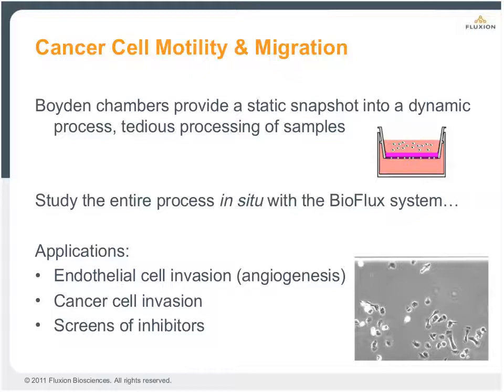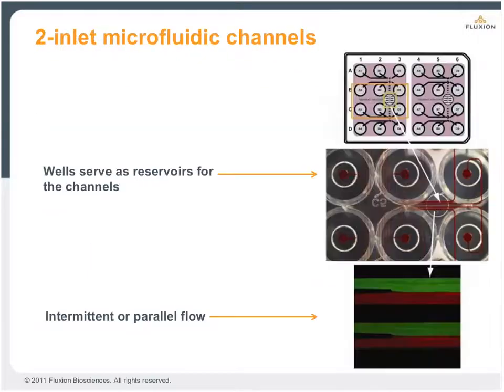This enables the entire process to be screened in the channel, and this includes applications such as migration, invasion, and endothelial cell development. In a way, you can think of the BioFlux channel as a lateral Boyden chamber or two-compartment assay. So what do I mean by this?